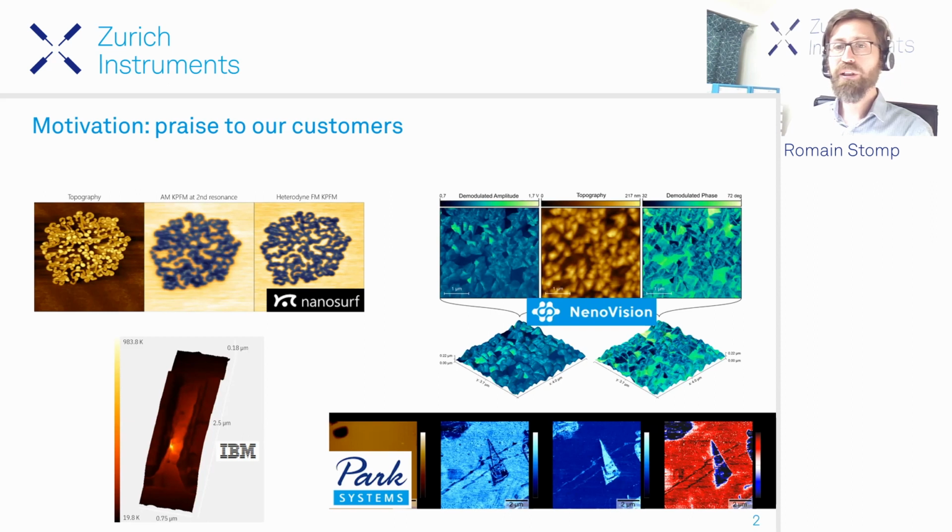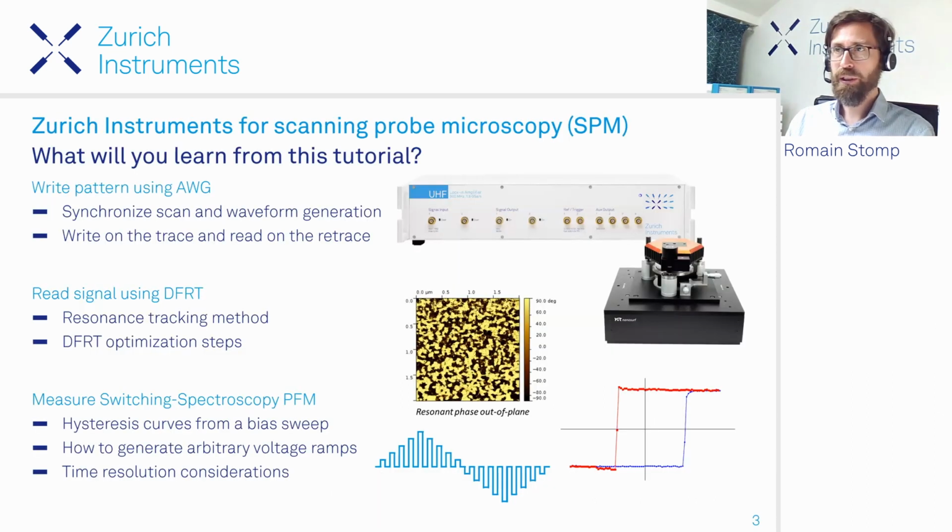From our side at Zurich Instruments, most of what we show are usually simple loopbacks from output to input or with a simple resonator. So these are very humbling experiences for us, but also great motivation to help everyone optimize the system and push the limit of resolution on their machine. With this in mind, I hope to contribute on my level on some of the specific modes and techniques that can be achieved with our instrument.